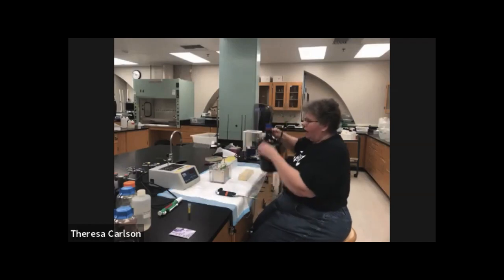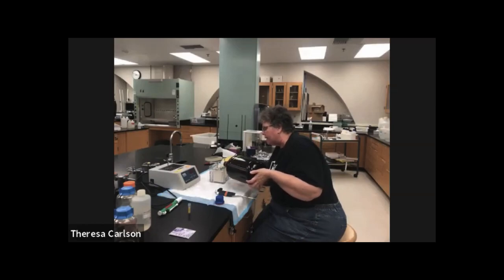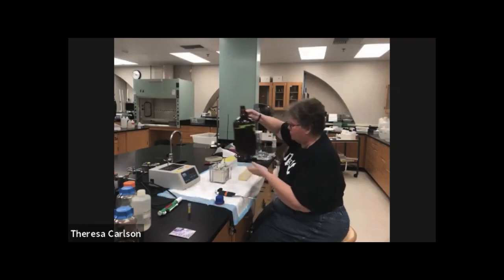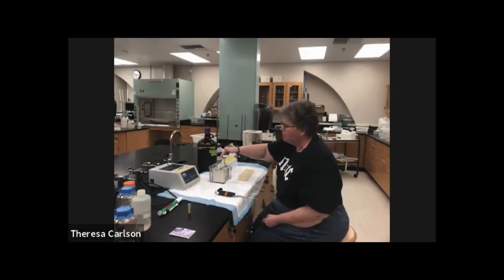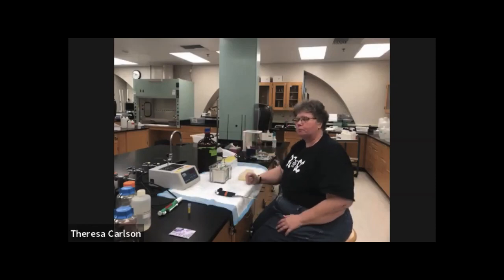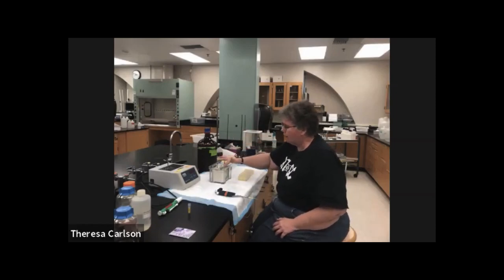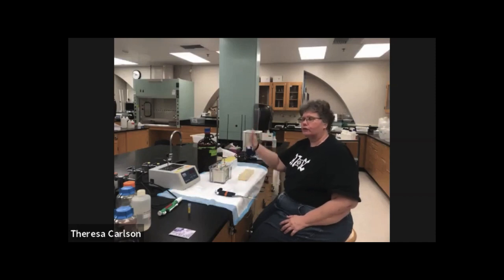Then we pour electrode buffer in here. We pour it both in between those two glass plates and outside the glass plates. The only constraint is that the level of buffer cannot be above the level of those glass plates. And that's because you want the current to go through the gel. You want the current to go from one electrode to the other, and where the wires are, one wire runs down the inside and one wire is on the outside, so that forces the current to go through the gel, bringing the proteins with it. So if you have the level of buffer higher than the level of the gel, the current will simply go over the gel rather than through the gel.